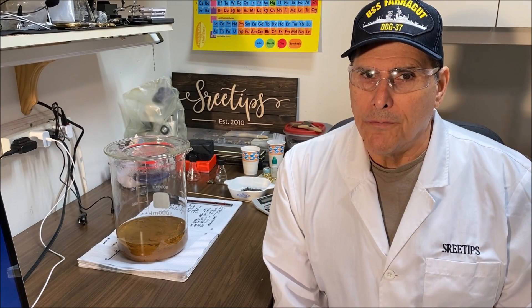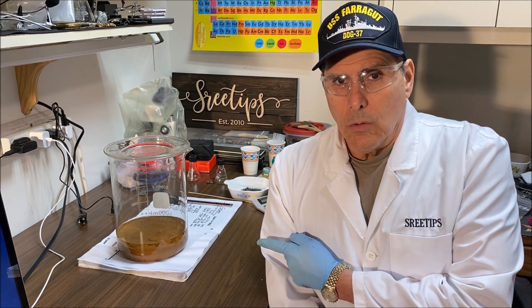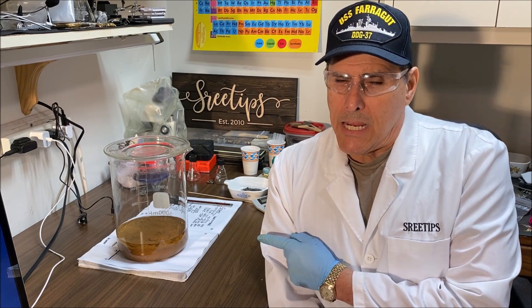Welcome to part five of the 25 troy ounce bar refining. I've got the gold here and I'm going to make a shortened version because I know everybody's waiting to see the final poured bar. What I'm going to do is redissolve this a second time, filter it, precipitate it, rinse it, get it into a crucible, get it melted, and pour the 25 troy ounce pure gold bar. Here we go.